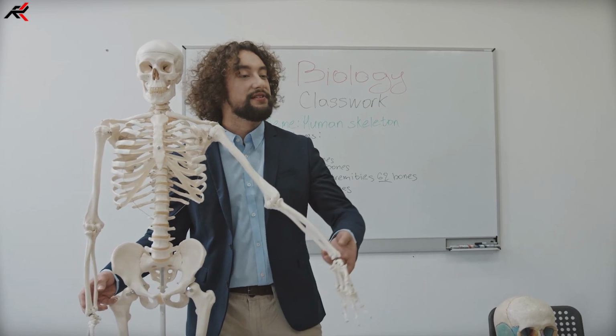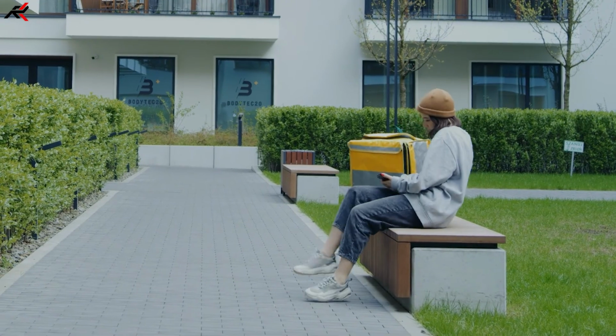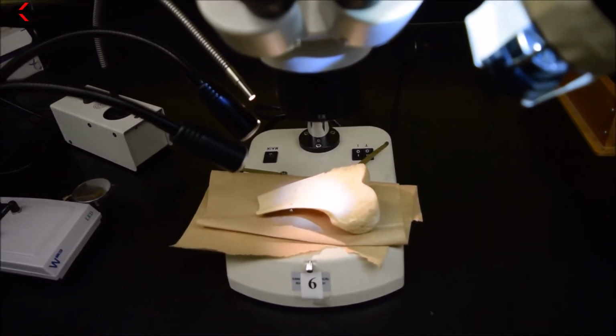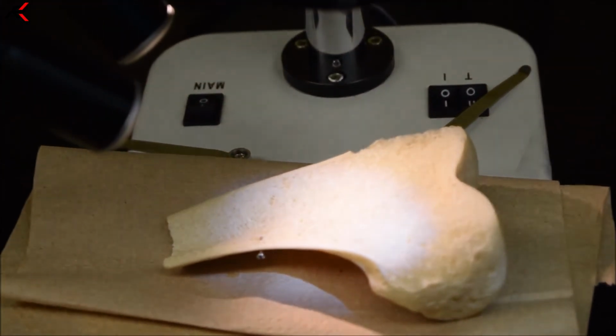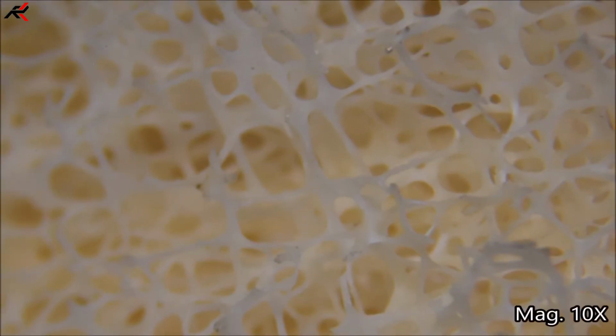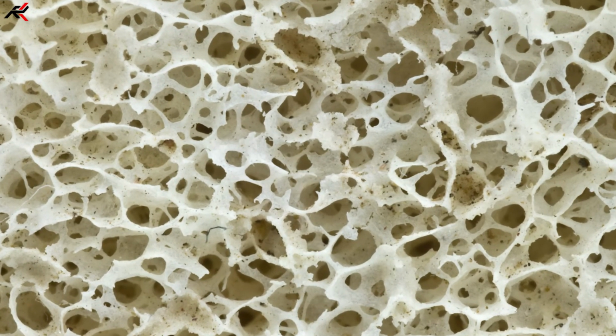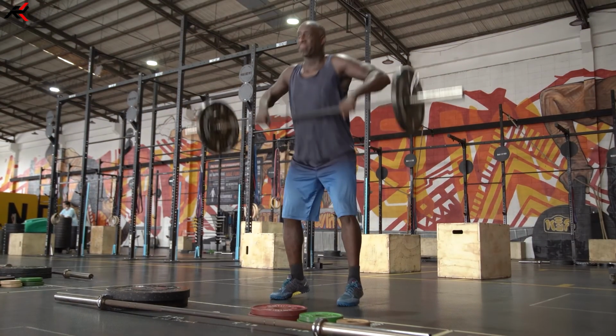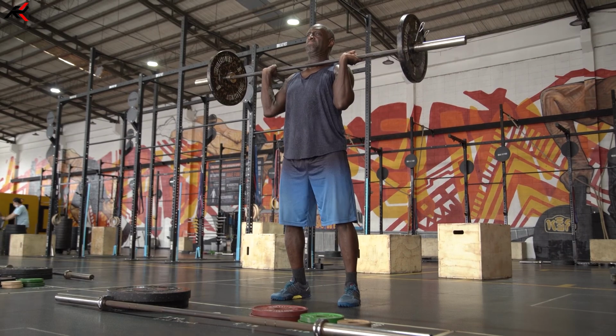Guys, bones are a very important part of our body, without which we cannot stand. But do you know how our bones look under the microscope? You will surely be surprised when you see it under the microscope, because bones look like this, which looks completely hollow. Now you will know that bones are hollow, but you can only see it under a microscope. Well, how strong is our body even though the bone is hollow?